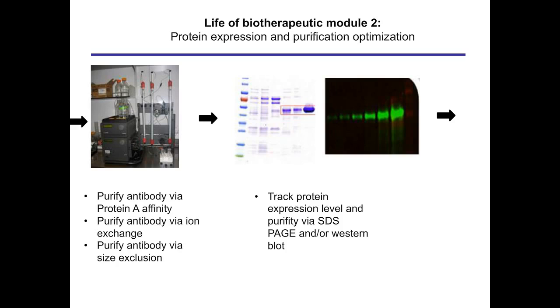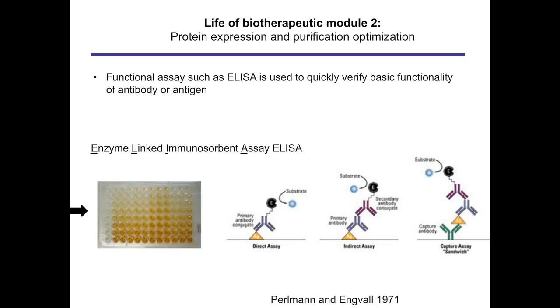Western blots are also used to confirm that the particular proteins being examined are the protein that you are actually trying to follow. And so you would typically generate antibodies specific to the protein of interest for the purposes of immunoblotting.